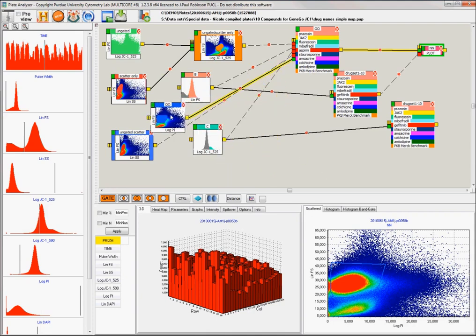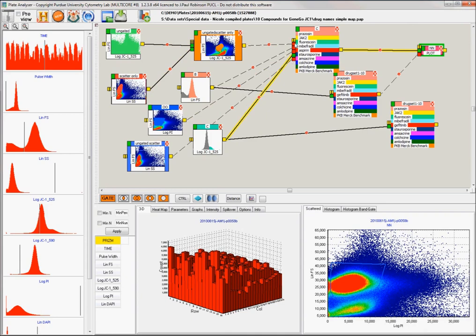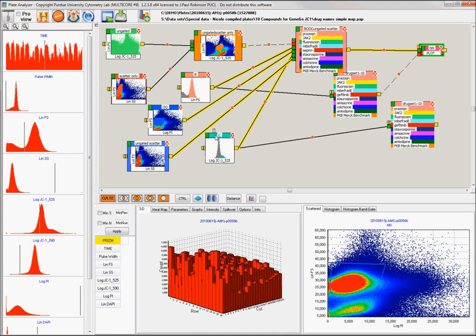The second feature is related to the first, and that is that you can move up and down, showing different links to different gates, and they will be exclusive if the yellow line is facing upwards. If, however, you click on that and have the bars parallel and in the horizontal plane, then you can select more than one link. In fact, you can select them all if you like. So that operates on all possible boxes.